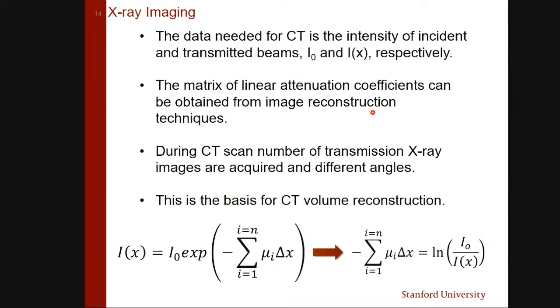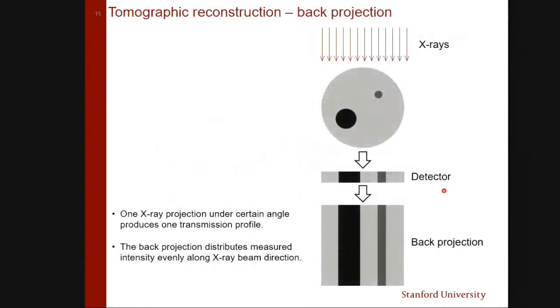And that's computer software which can do that for you. Okay? So that's what we will do, and this is the basis for CT volume reconstruction. I will show you how it's actually done in one way. There are other ways as well. But for example, we have an object here. There's a bigger sphere and a smaller sphere within this background.